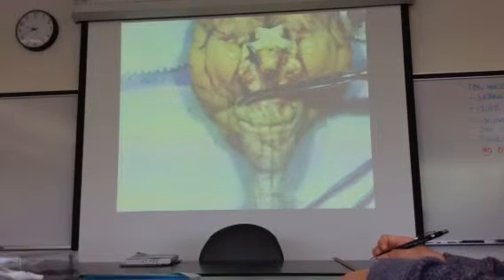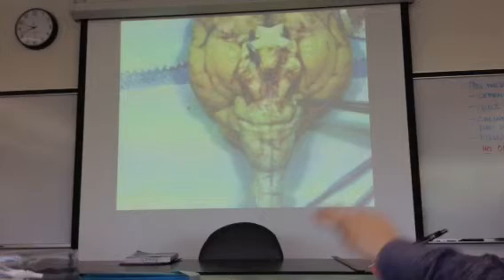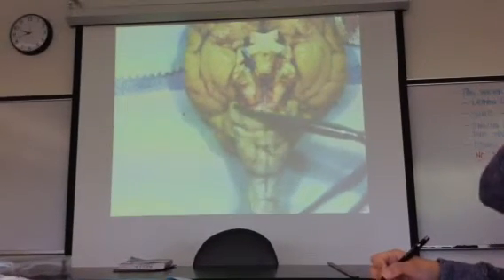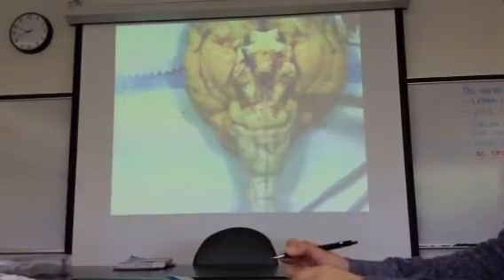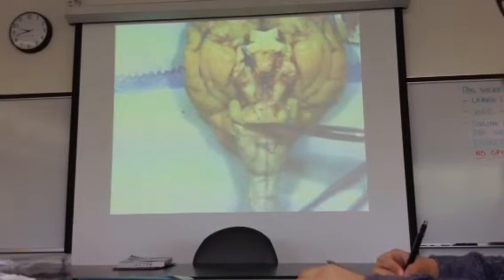Here's trigeminal 5, really fat, huh? Do you guys remember the short, fat, stubby ones on the brain models? Well, these are also fat, but I cut them a bit longer than what you're used to seeing on the brain models. Trigeminal 5. Okay? Between them, you will find this bump. This is the pons.